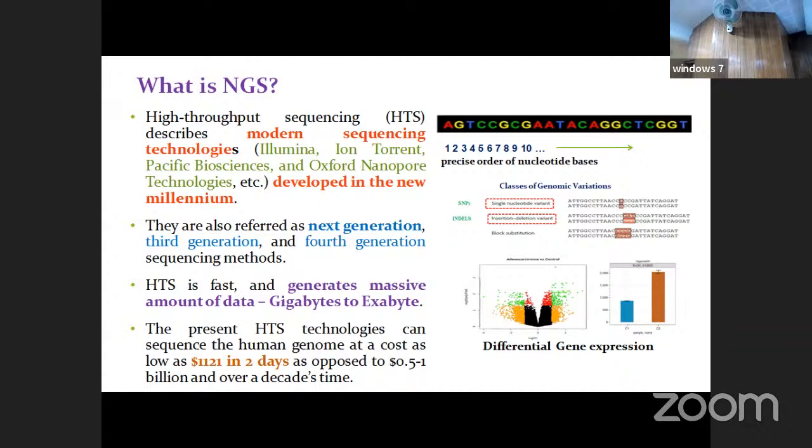You submit to, say, NCBI, and then you will get an accession number. Then you will compare whatever genome you have sequenced with the existing genomes, to see how it is different, right? When you are studying evolution, you are trying to see the phylogenetic lineage of the organism you have sequenced. First, once you are sequencing, you are trying to identify the precise order of the nucleotide bases. Once you have constructed the genome through genome assembly techniques, the next step is to identify the evolutionary relationship.